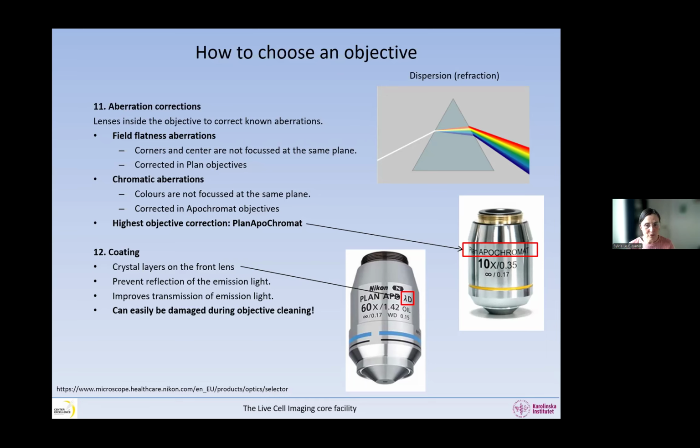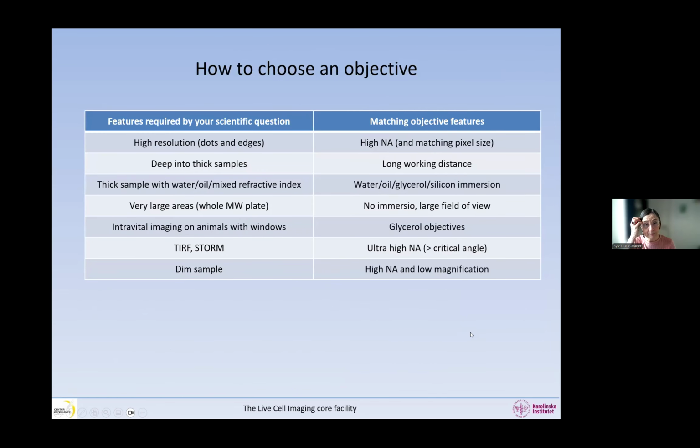This is an immersion objective. When you're finished with your work, you're going to have to remove and clean the oil away. You do not scrub the objective, okay? So you're going to have to watch a little video to teach you how to clean the objective. It's part of the assignments here.